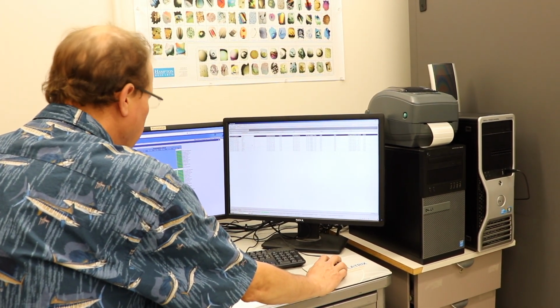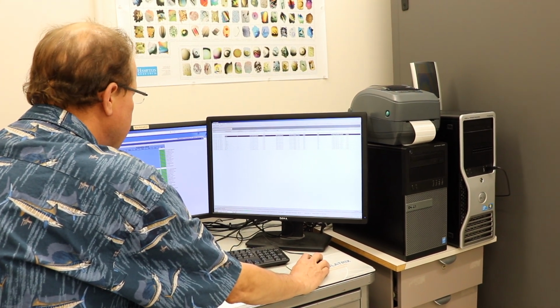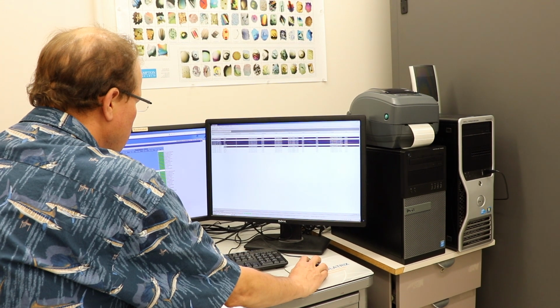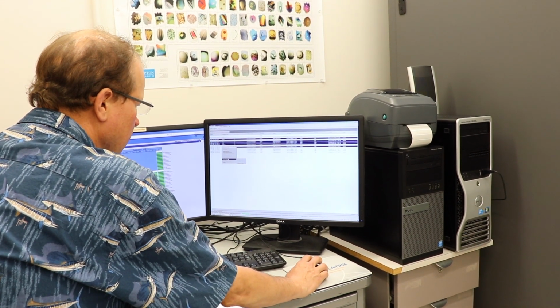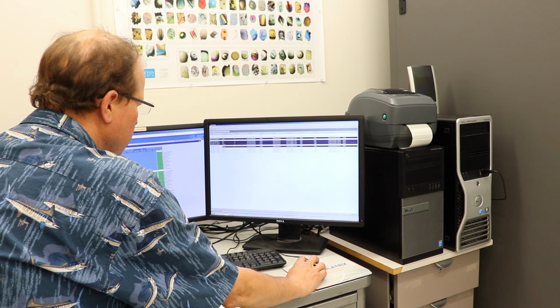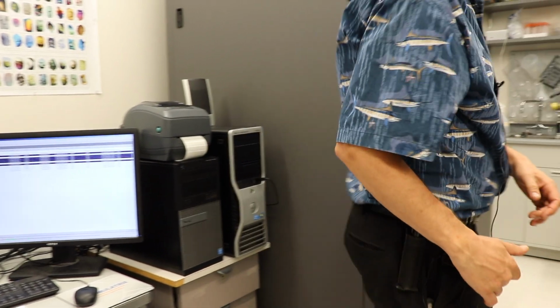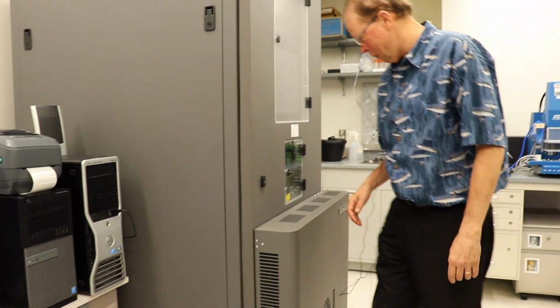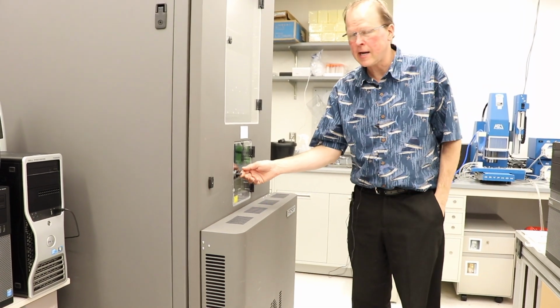If you want to do multiple plates, you can do up to 6 at a time. Either use Control or Shift to highlight the ones you want to remove and bring those to the Load Port Hotel. So the robot should bring it to the Load Port Hotel.